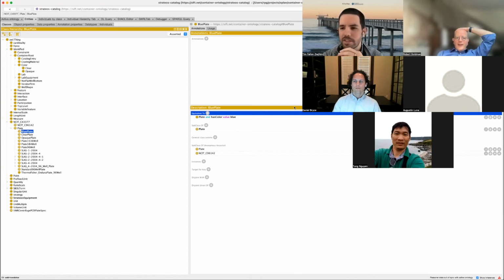And I think that sort of starts to intersect with this idea of inventory management, which is complex, of course. Like I saw one of the properties was, at a given lab, like at Stratios or something like that. So the more concepts that get added, the more modular it can be, it seems that it's easier to add things to it. Yeah, I mean, kind of what comes to mind.